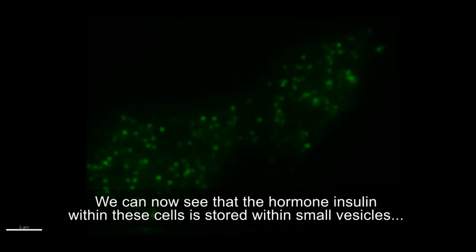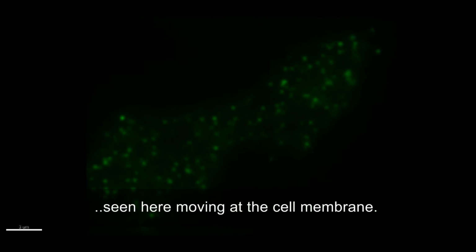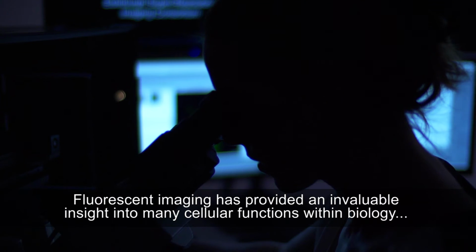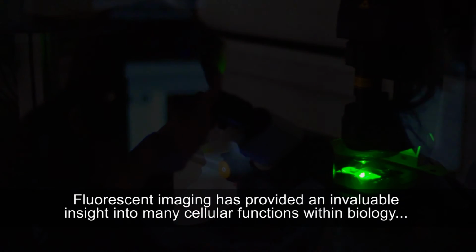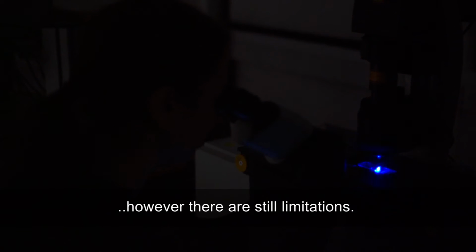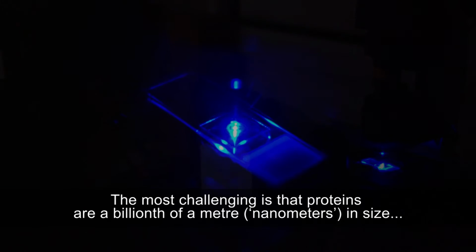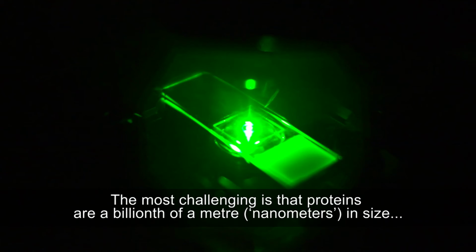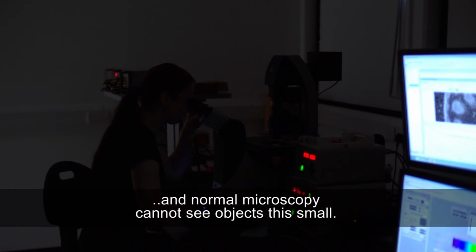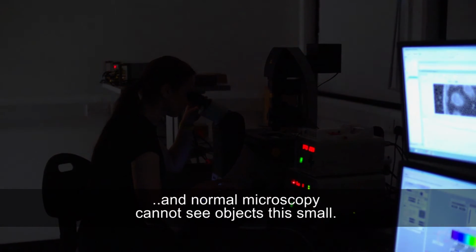We can now see that the hormone insulin within these cells is stored within small vesicles, seen here moving at the cell membrane. Fluorescent imaging has provided an invaluable insight into many cellular functions within biology. However, there are still limitations. The most challenging is that proteins are a billionth of a meter, a nanometer, in size, and normal microscopy cannot see objects this small.